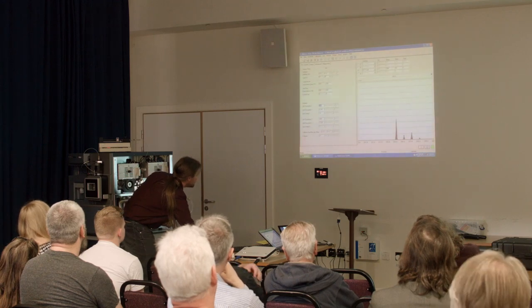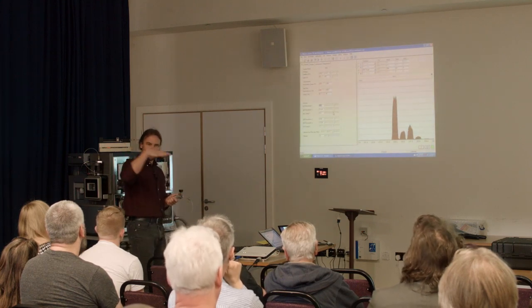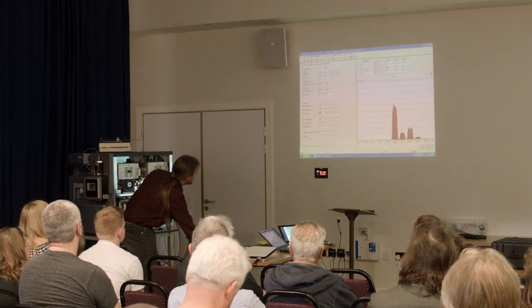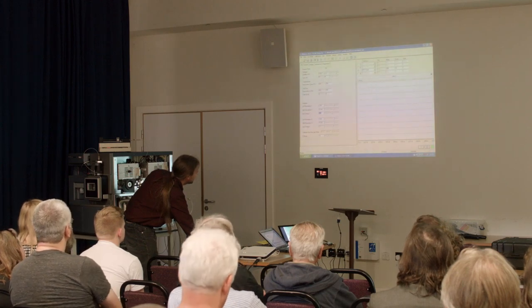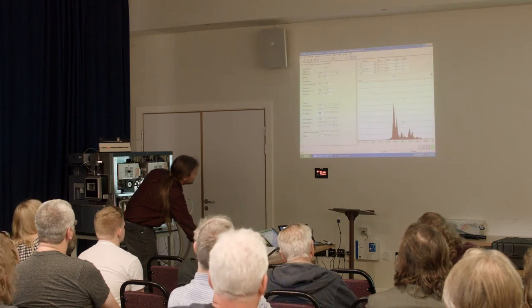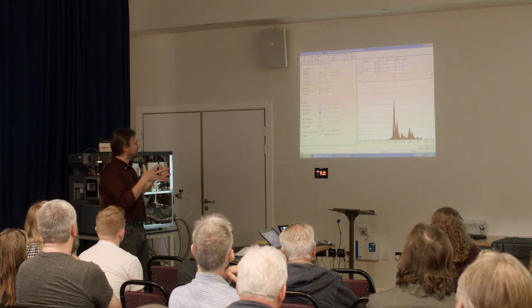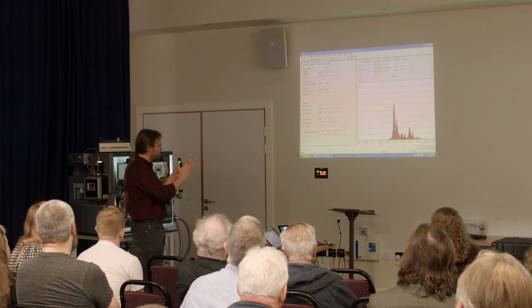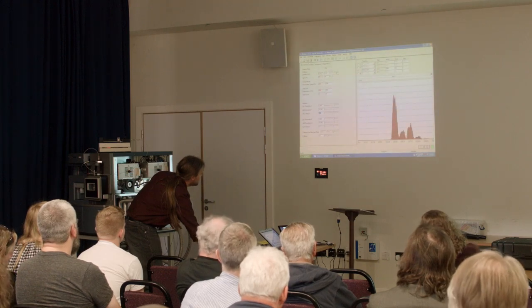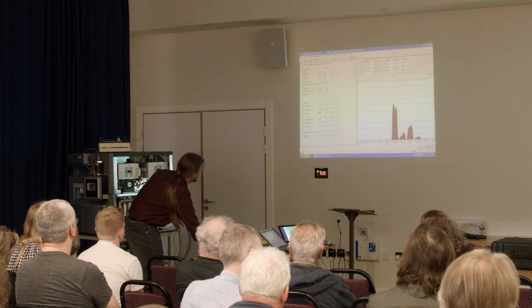We've also got the ions, which have to move through the system, so we have to give them some ion energy. Everything is going from a high potential energy to a low potential energy. At the moment, we've got an ion energy of about 0.3. If we try and make them go backwards, they're not going to go backwards. And if we push them through the quadrupole too much, we get what are called chicken head peaks. Basically, the ions are going through the quadrupole too fast, and they haven't got enough cycles of RF to be properly resolved. The ions are traveling through here at about 300 meters per second, something like that, so they're traveling through quite quickly.